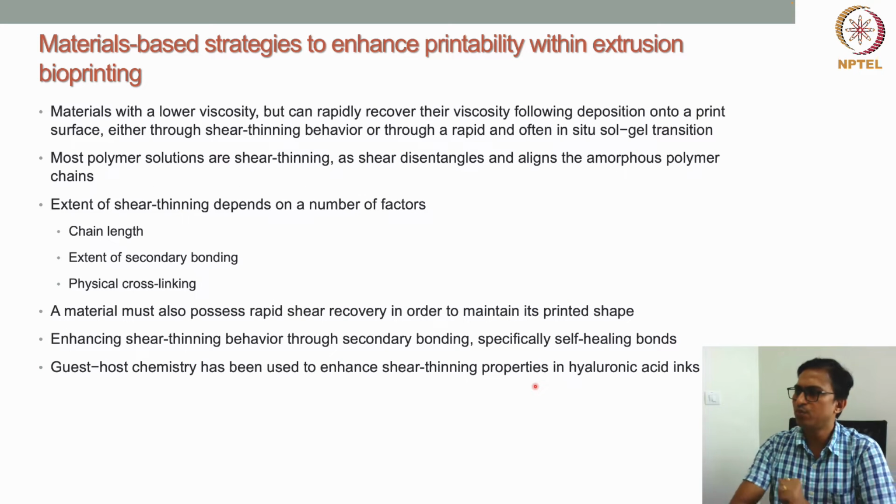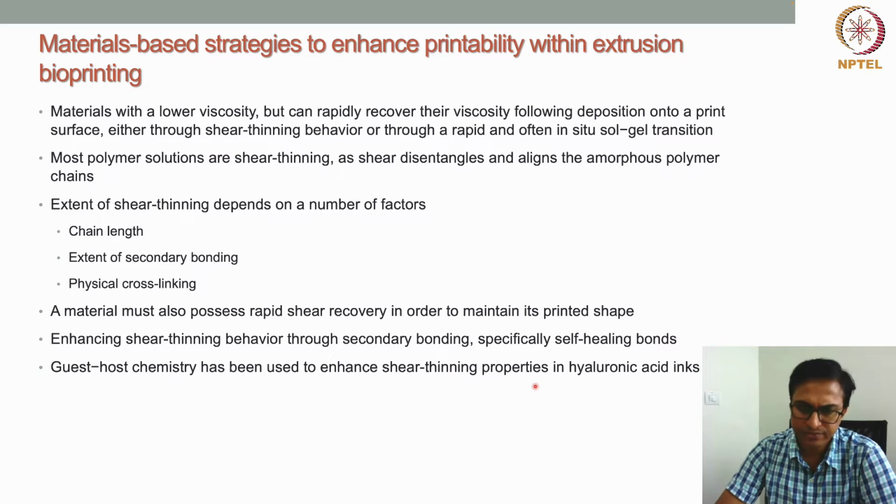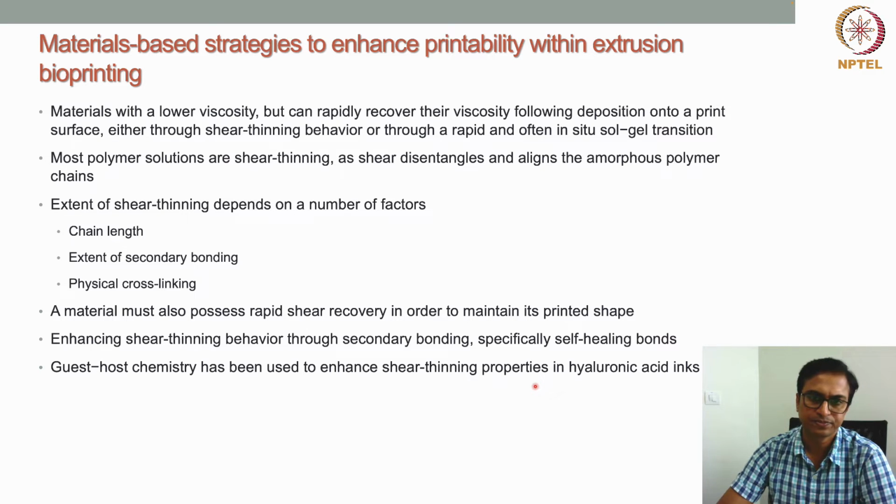Now we have seen some ways to address the printability concern for extrusion based bioprinting.